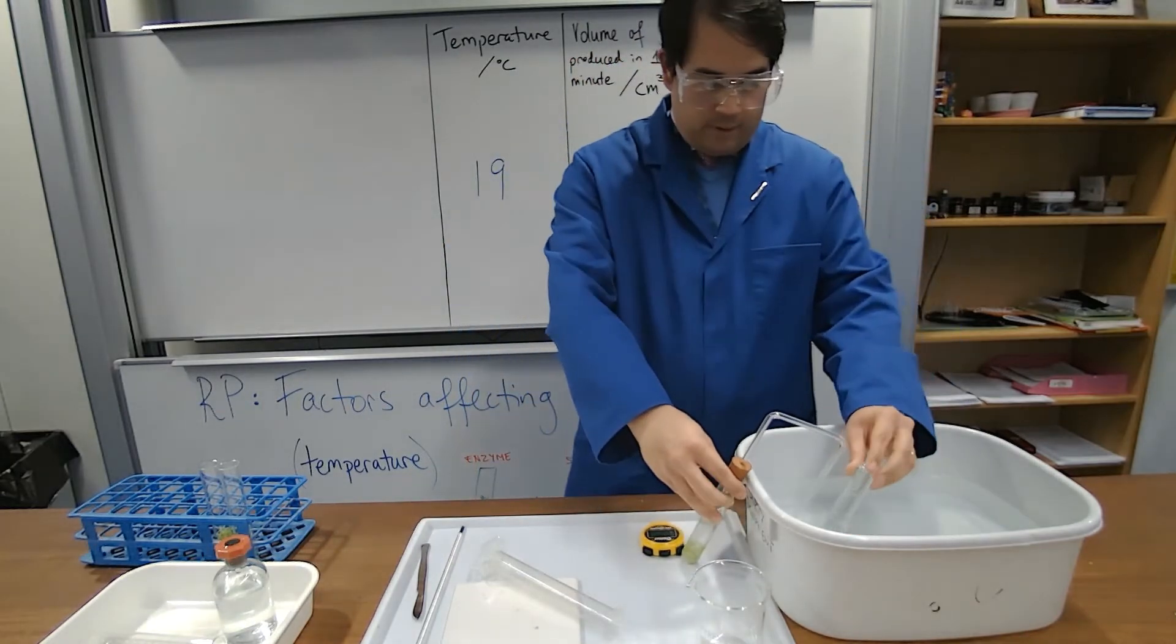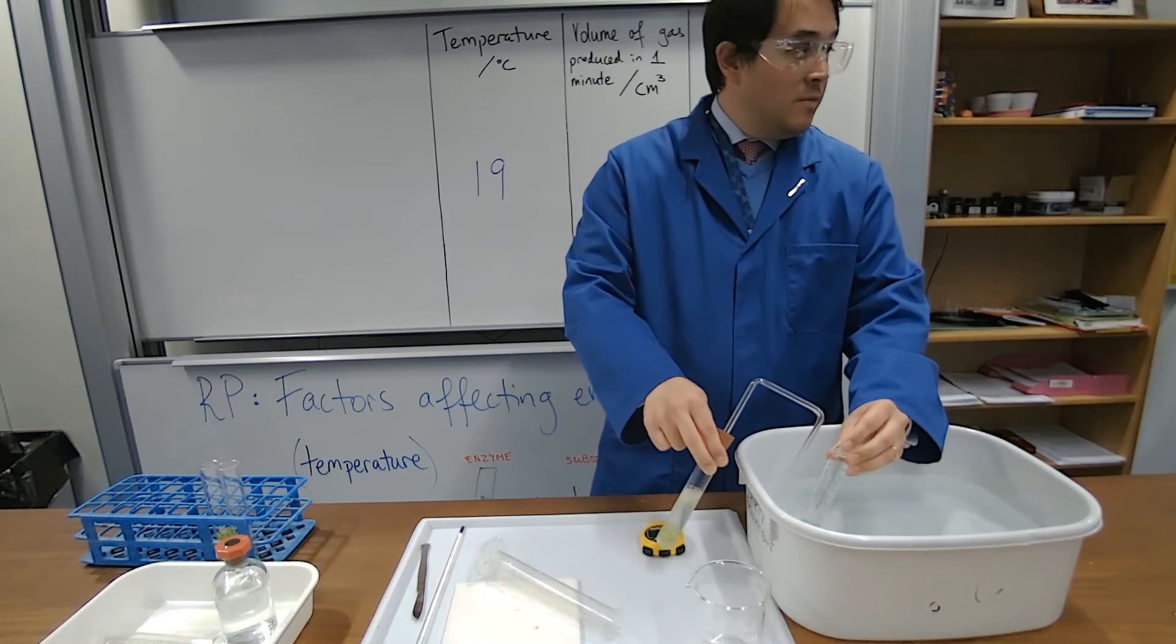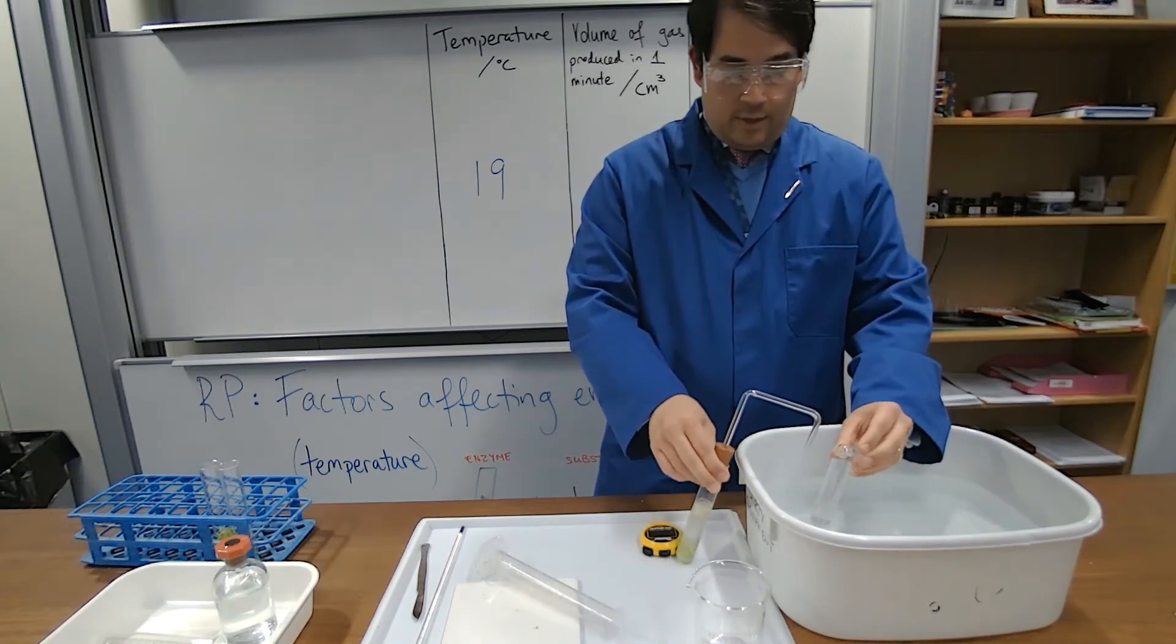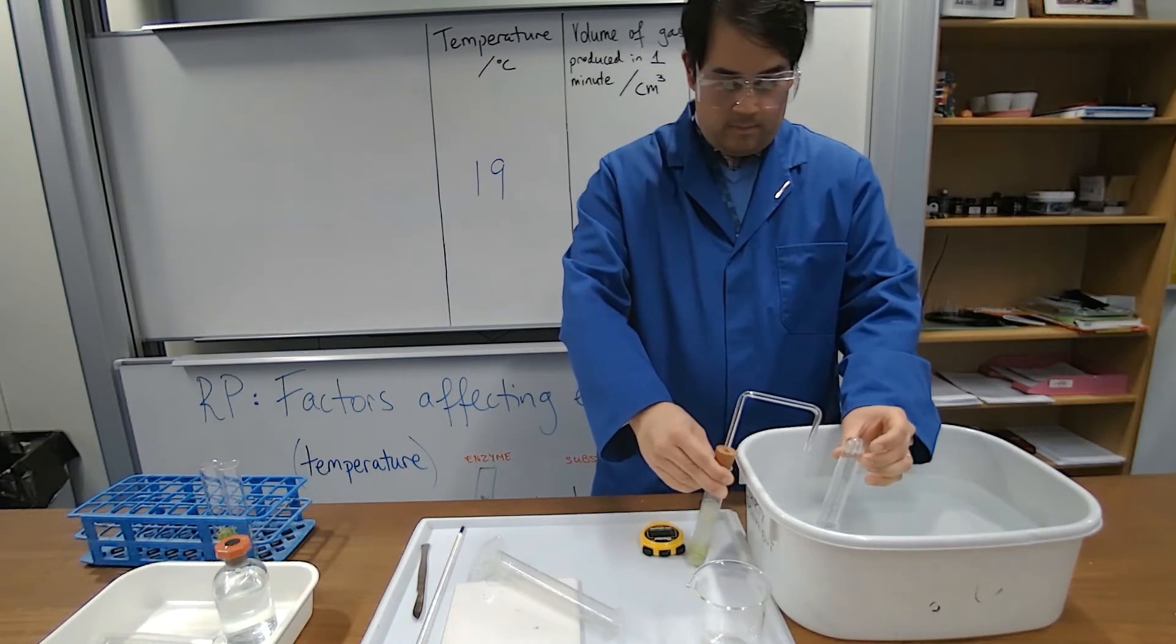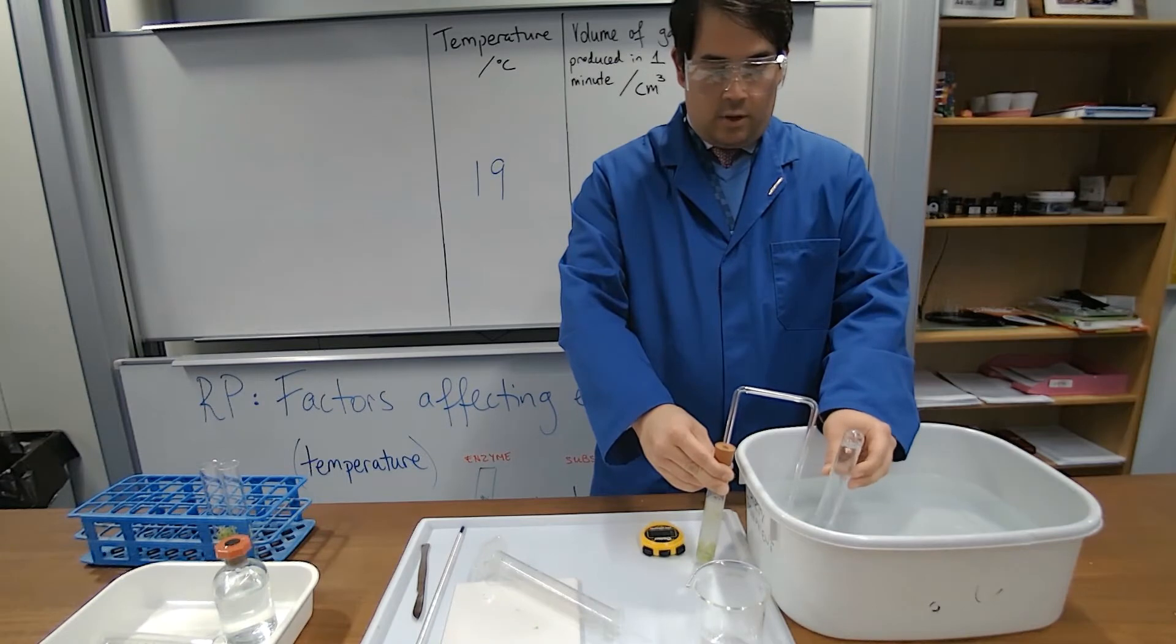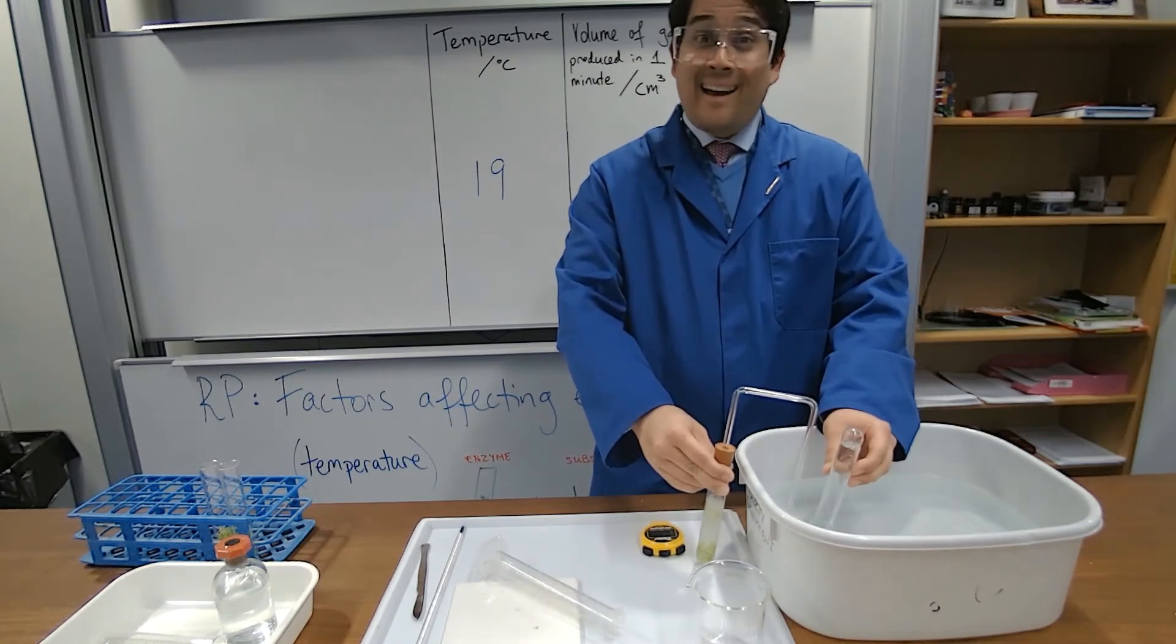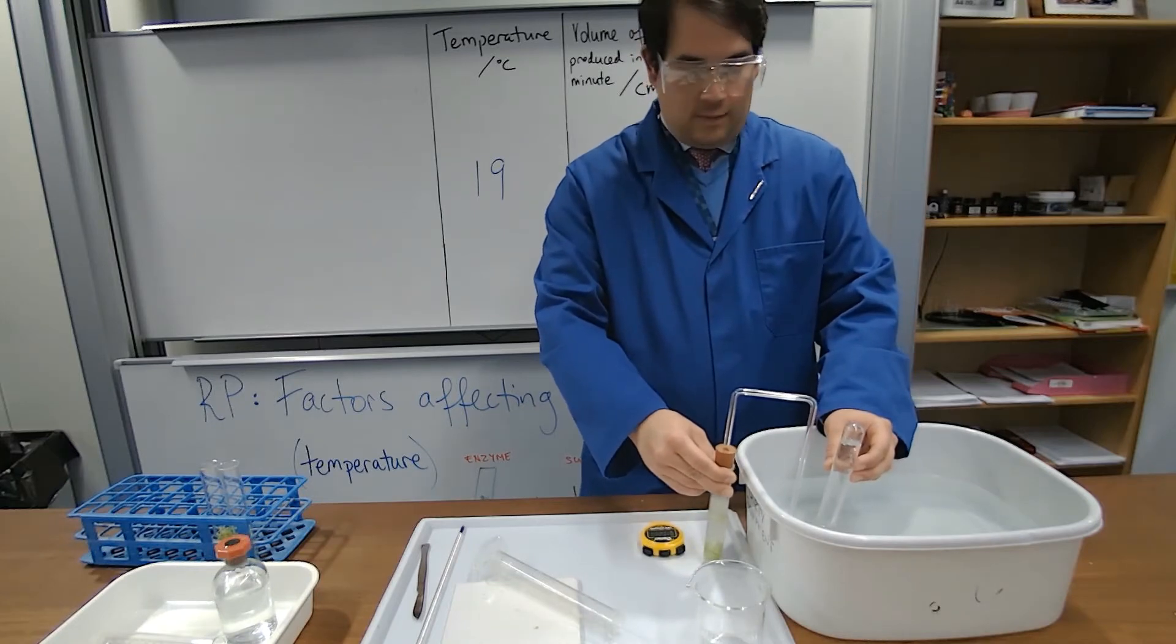You can see bubbles are now coming out. I don't know whether the high definition of this video will be visible or not, but as you can see bubbles are coming through already and pushing that liquid down. Now, do you see that bit of my fingers there? Let me turn the boiling tube to the side. Look at that.